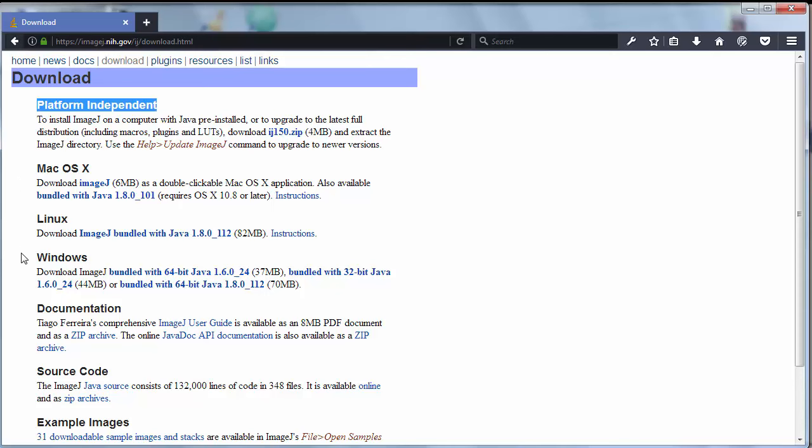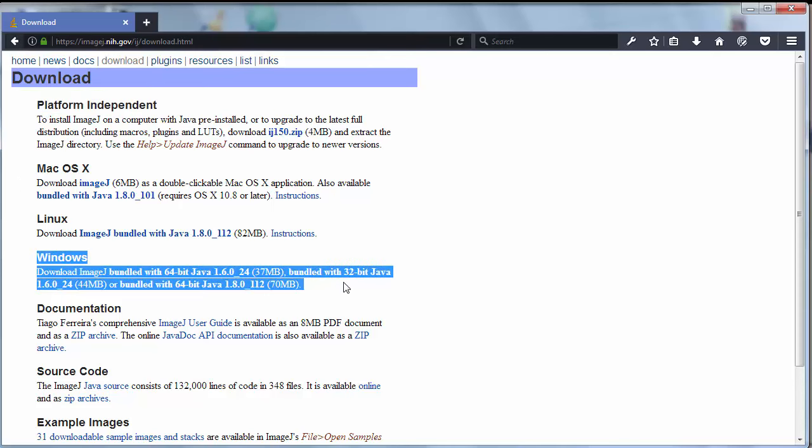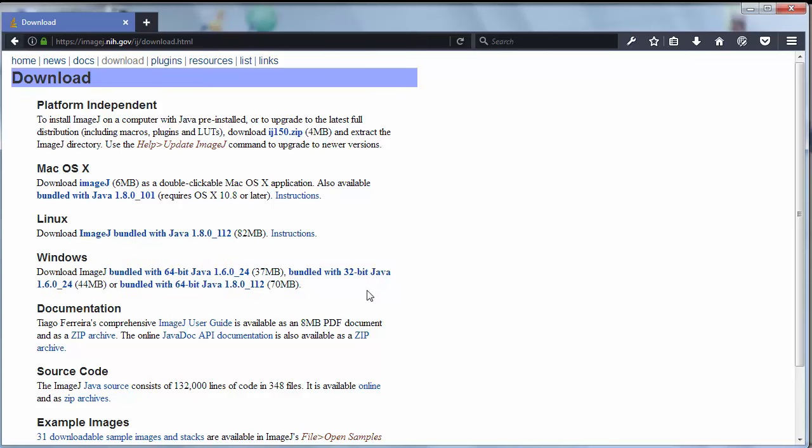I'm gonna download it for Windows. Here I'm having three different installation files.